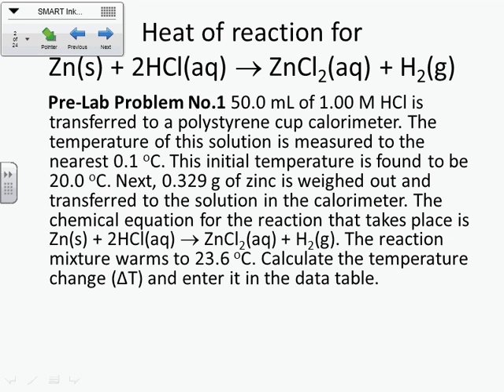All right. So here's our reaction for if you take zinc and you put it into hydrochloric acid. Okay. We actually did this last year. I don't know if you remember. It was very close to the beginning of the year. Anyway, we did this last year. We put zinc into hydrochloric acid. It bubbles a little bit. Doesn't do a whole lot, but it does react.